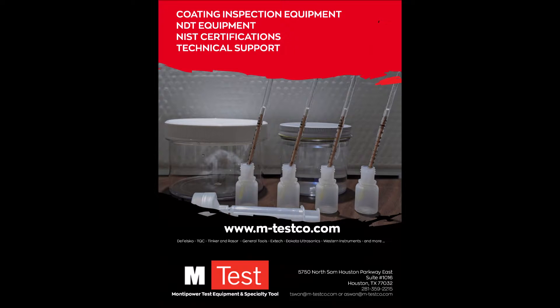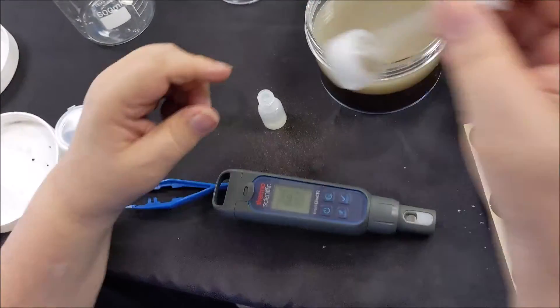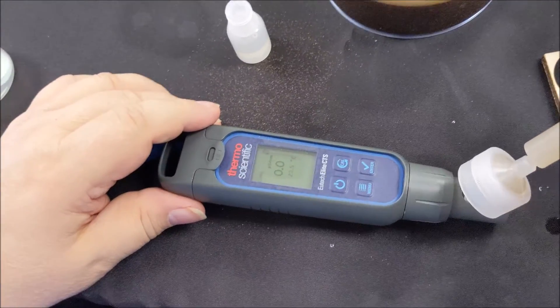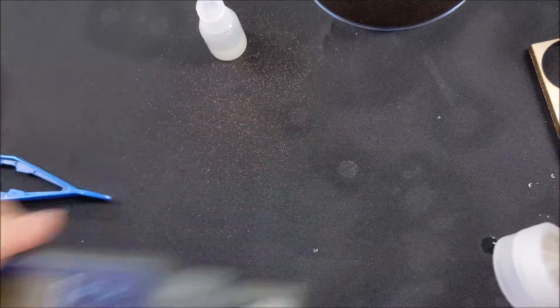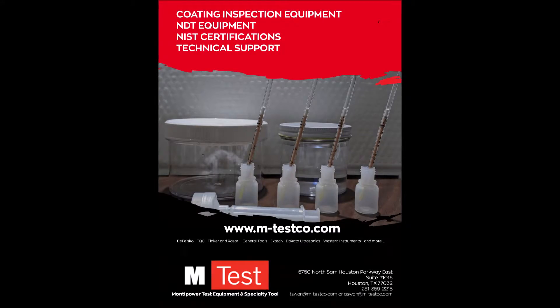To get this test to comply with ASTM D4940, you can add a conductivity meter which we can provide and is an option when you purchase this kit. Make sure you check the description of this video for the test methods and the run through on how to do this test.